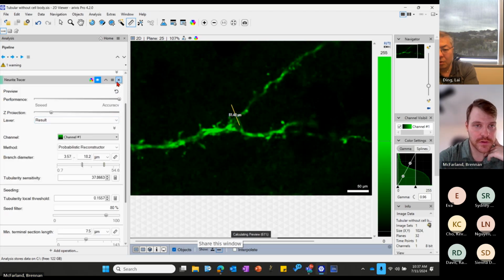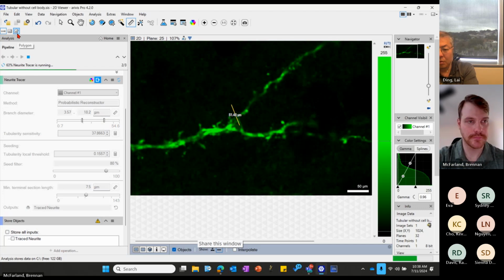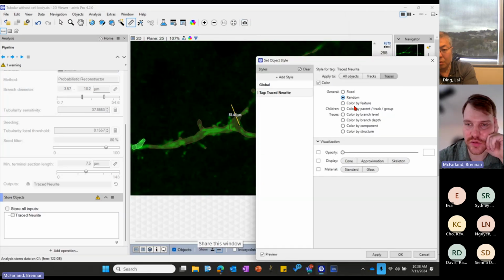So I'm going to go ahead. We can either hit this run pipeline to here, but I'm just going to hit the step forward one, telling us it's running. Give it a second. All right. So we have fewer results than before. I think we had 9 before, with some extra neurites kind of in the background. And let's change this to a random color.